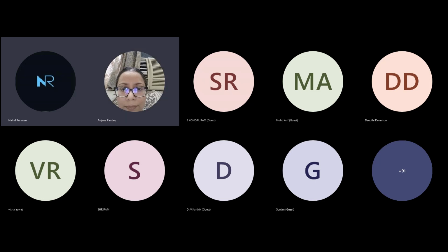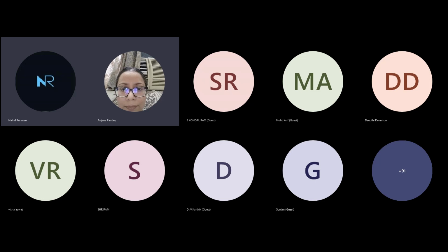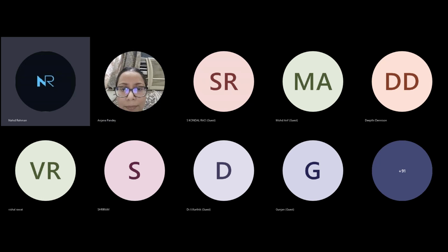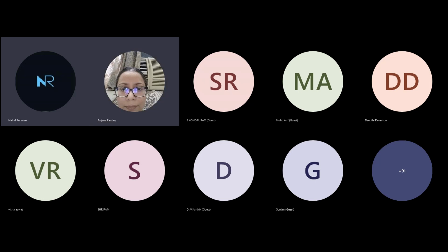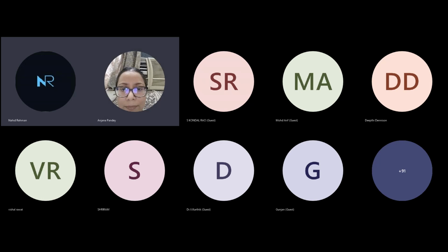For that, you need to do the calcination, and that calcination is the heating of that material which you prepared. And for that, when you heat it at a specific temperature for some period, some few hours, all the crystalline materials which you are synthesizing, they rearrange themselves.